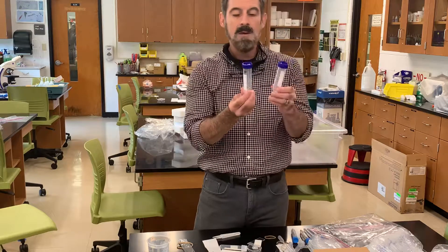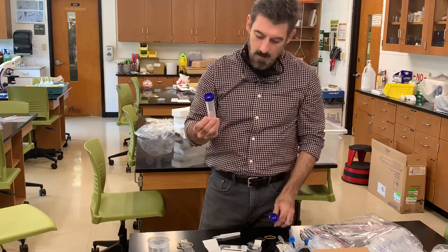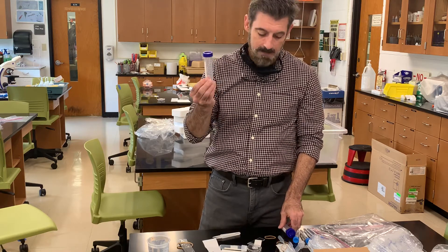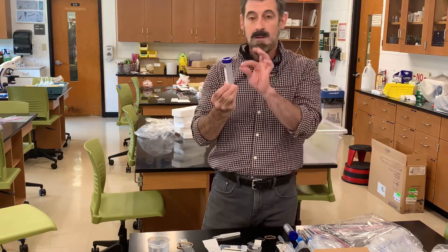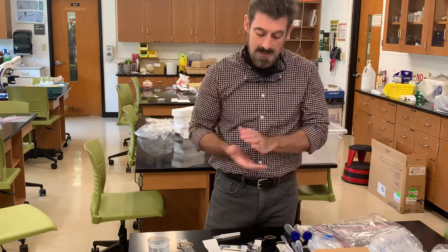There are some larger tubes as well that you might use for other experiments. There's a particular one where we're going to do a catalase experiment — an enzyme lab — and you might use these to measure the activity of the enzyme in that lab.